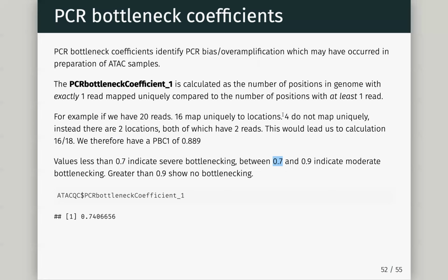Most of the time, this is ENCODE data, and you can see it's very close. Most of the time with your data nowadays, you'll be quite a lot higher. Without slagging ENCODE, ENCODE got there first. They were doing these methods when they were still developing, so a lot of their quality metrics are quite low.